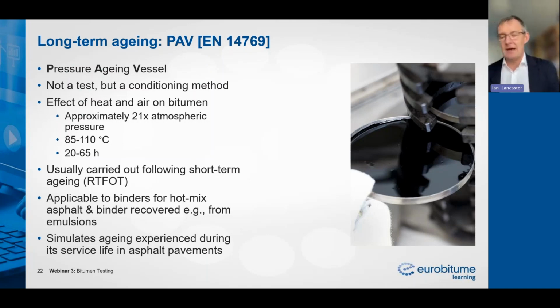And again, we can do that any number of ways. And the pressure aging vessel is there to simulate what happens as bitumen in an asphalt mix ages.